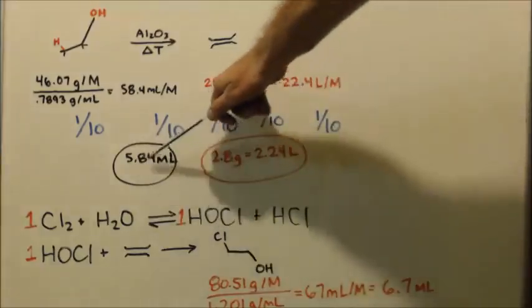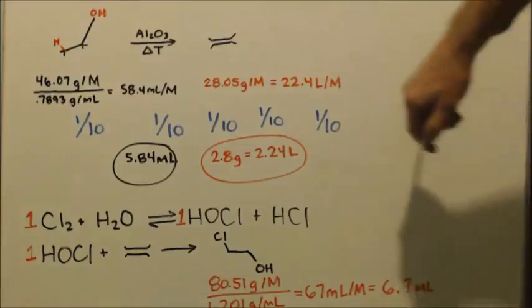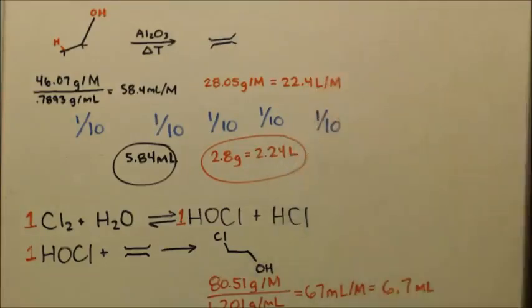I'm going to put this much alcohol, this time ethanol instead of rubbing alcohol, vodka. Well, actually, it's anhydrous. And I'm going to get that much out.